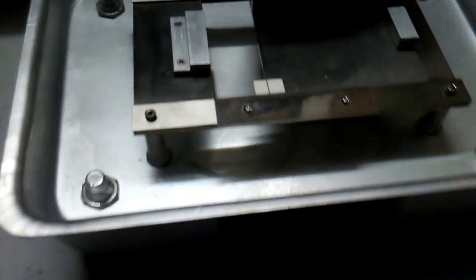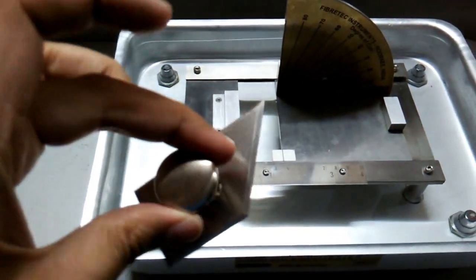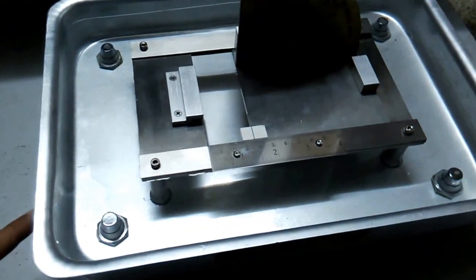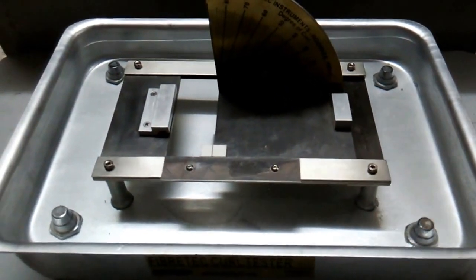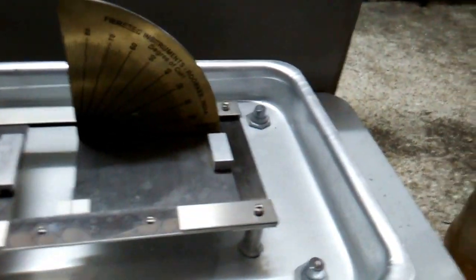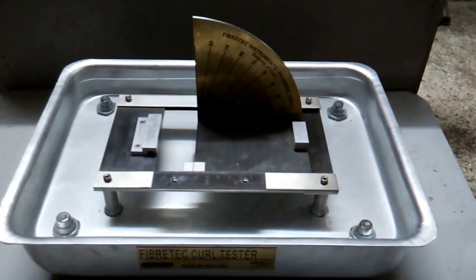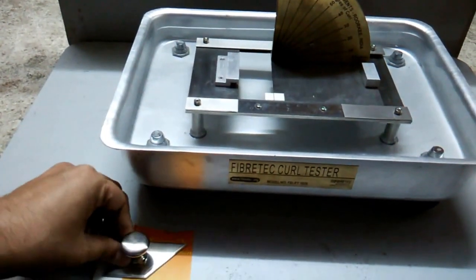The screws here are for leveling the equipment. We have a template of trapezoidal shape to cut samples of the paper. You must ensure there should not be any leakage of water, and you can cut a template according to this.